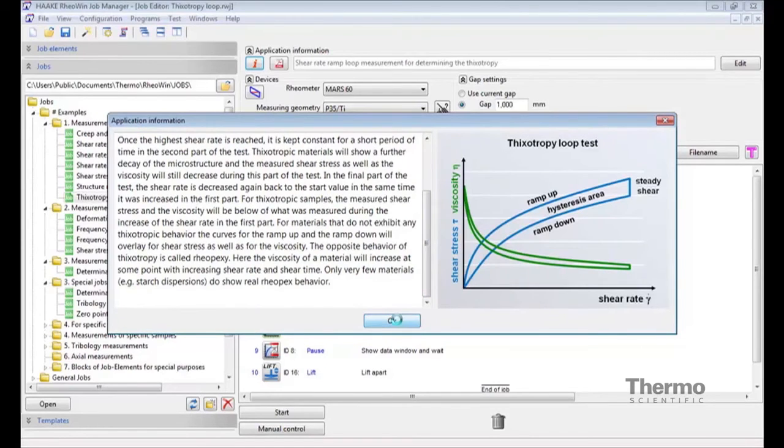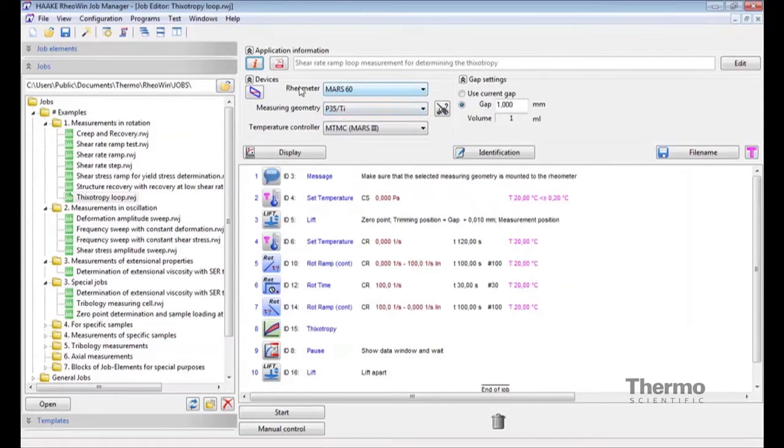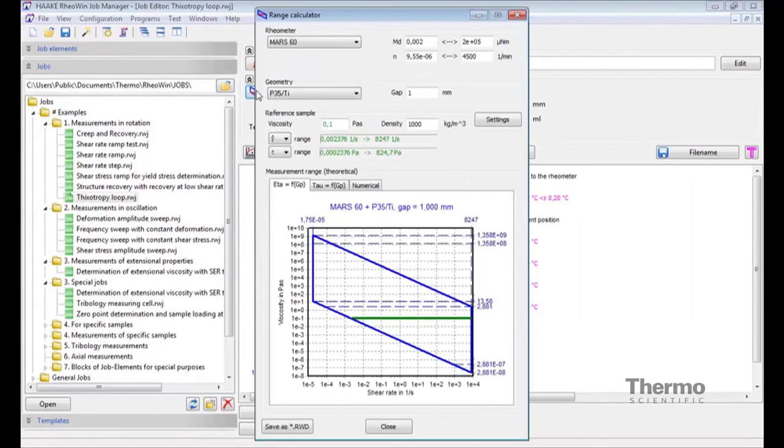Also, the so-called range calculator shows the full measuring range of the chosen rotor in the measuring procedure towards a freely selectable viscosity.